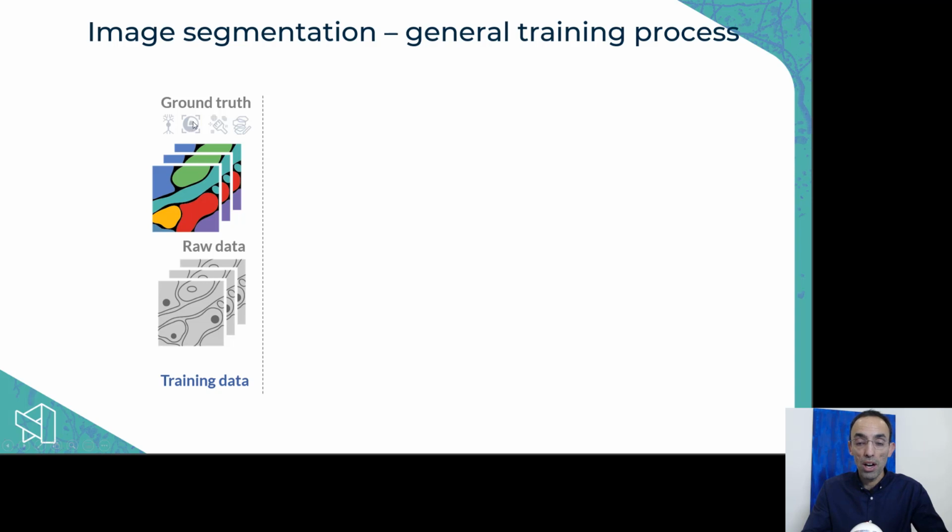You can do object segmentation, you can use a pixel classifier, or the contour editor, which is actually the tool that will be demonstrated today. So the contour editor together with the neuron composer create ground truth annotations for training a deep learning model. That, together with the raw data, makes it possible to train a deep learning model.